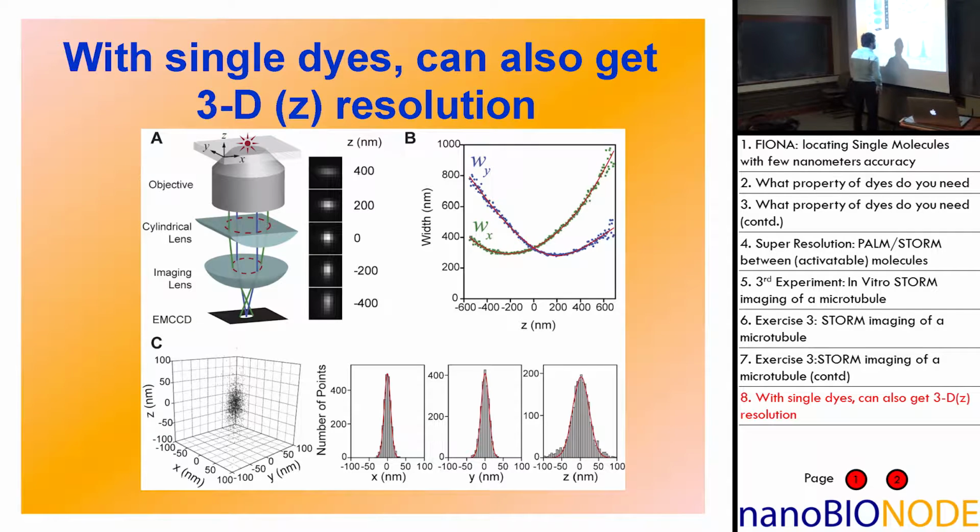Well, in some senses, there's a fluorophore. I mean, let's say that this wasn't here. You get a fluorophore, and you get an image that looks like that, right? Okay.